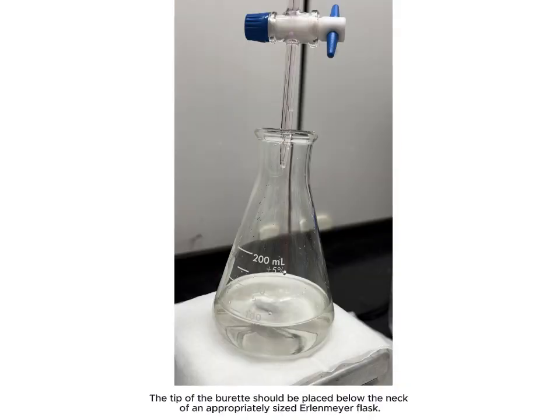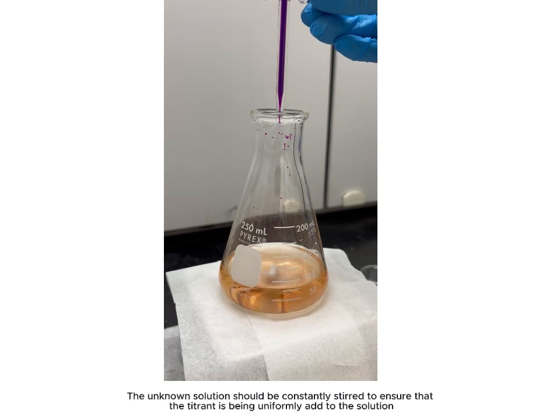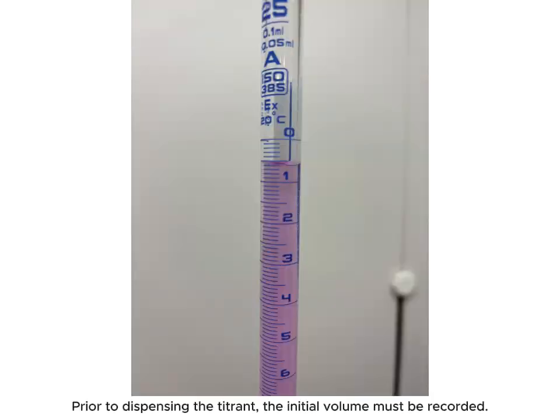The tip of the burette should be placed below the neck of an appropriate sized Erlenmeyer flask. The unknown solution should be constantly stirred to ensure that the titrant is being uniformly added to the solution. Prior to dispensing the titrant, the initial volume must be recorded.